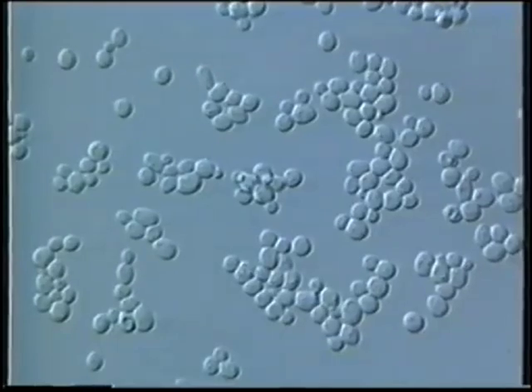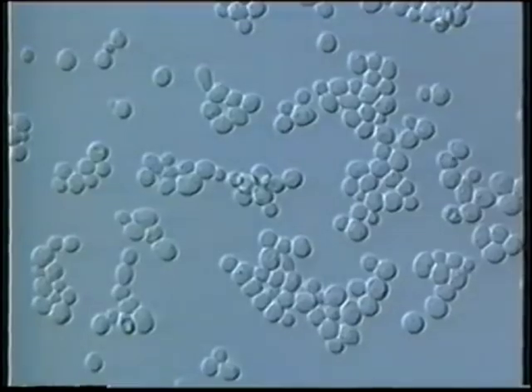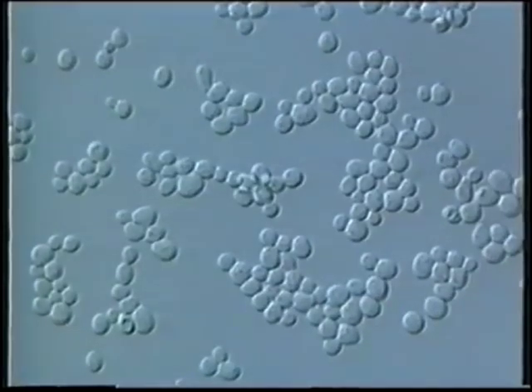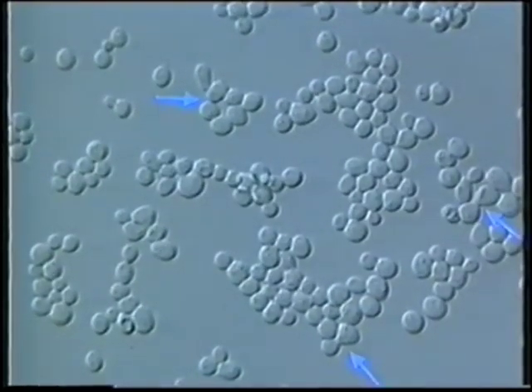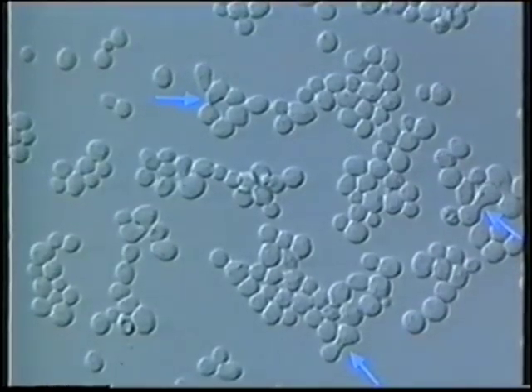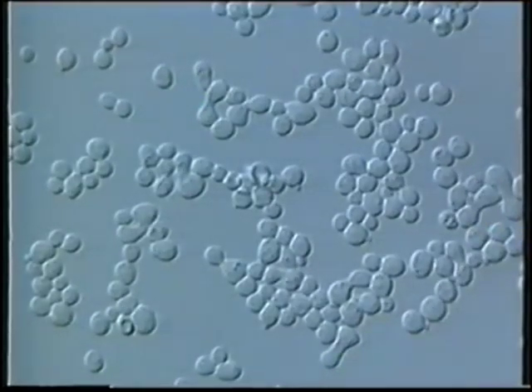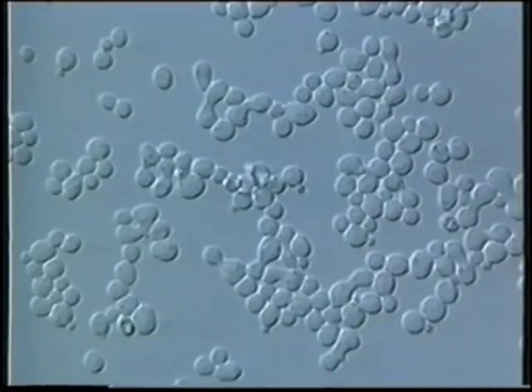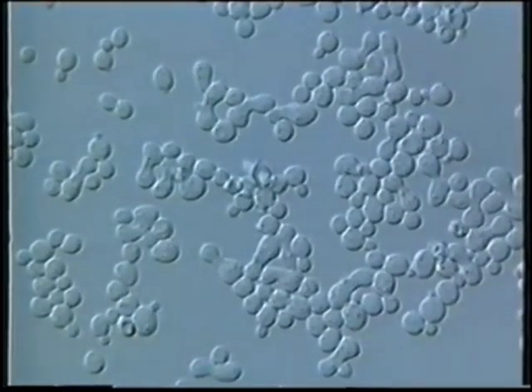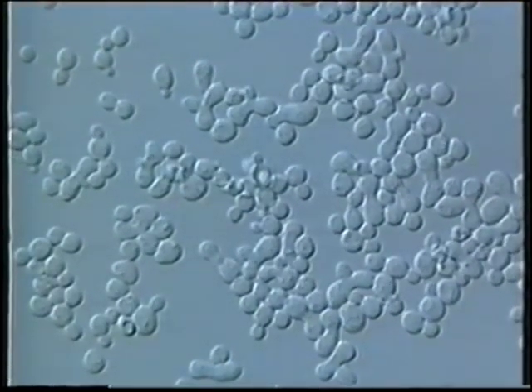Here is a mixture of haploid cells of opposite sex. They have formed clumps under the influence of sex-specific chemicals called pheromones, which are small peptides. Pairs of haploid cells of opposite sex fuse to form diploid zygotes, with a very peculiar dumbbell look. Many haploid cells do not fuse. Yeasts have no active way to look for partners.